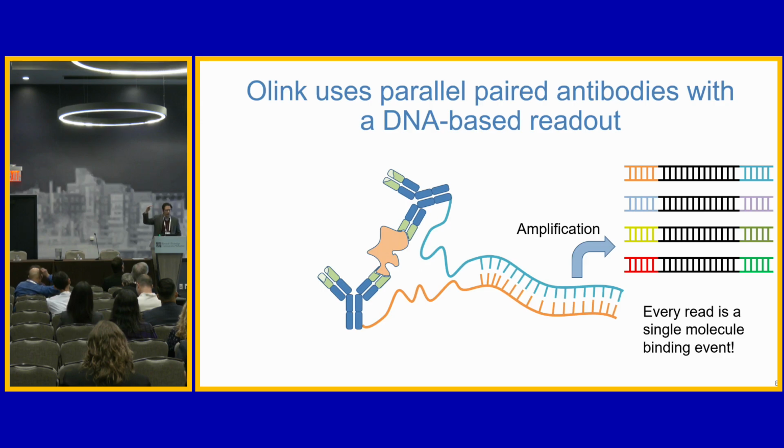And the idea here is that each one of these sequences can be parallelized because you can label each one of them with a reporter region, right? So each binding event has a reporter because you sequence that section, and each section of double-stranded DNA can also have ligated to it a barcode for that particular sample. So you can do this actually in quite high throughput, right, with multiple sets of samples simultaneously, multiple sets of proteins simultaneously. And so this is an alternate way of trying to analyze a proteome, again, using two binding events to measure that specific protein.